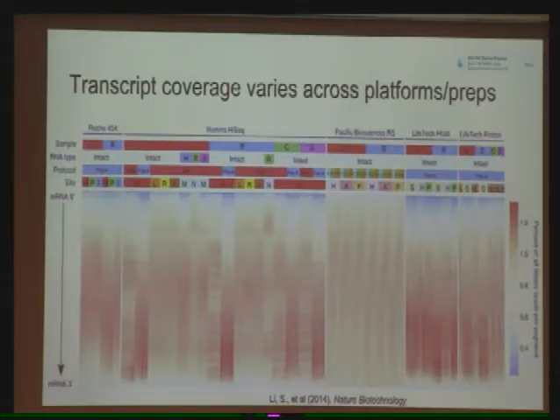I've worked with a lot of Illumina data, and this type of bias is pretty normal. I've seen that a lot. Oh, these are different sites. But these sites, as you can see, didn't get quite as much bias. So even from site to site with the same protocol, you can get it a little more even. Anyway, questions about that? Yeah?